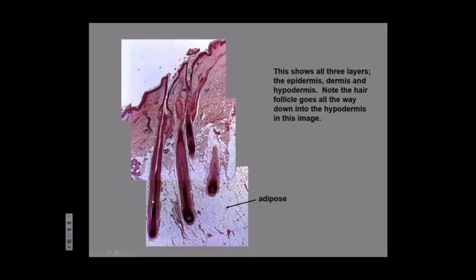So you might just catch the edge of the follicle that's in the dermis. And you might even just catch an edge of the follicle that's just in the epidermis and not in the dermis because it's going on an angle. So if you cut the tissue on a slice, then you're not going to get it all. Okay? You have to use your imagination and you have to think three-dimensionally when you're looking at two-dimensional images.